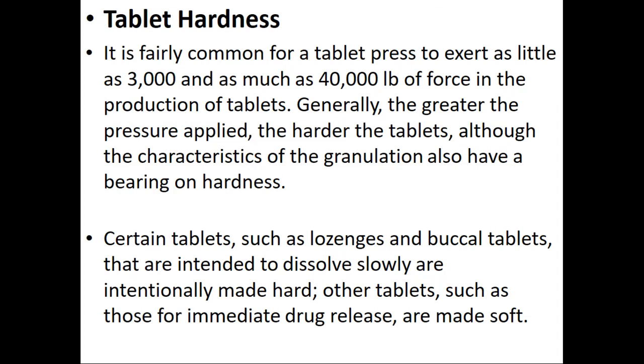Now let's talk about tablet hardness. It is fairly common for a tablet press to exert as little as 3,000 pounds and as much as 40,000 pounds of force in the production of tablets. Generally, the greater the pressure applied, the harder the tablets.